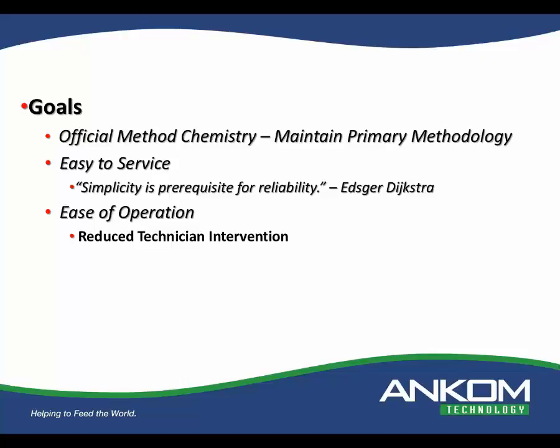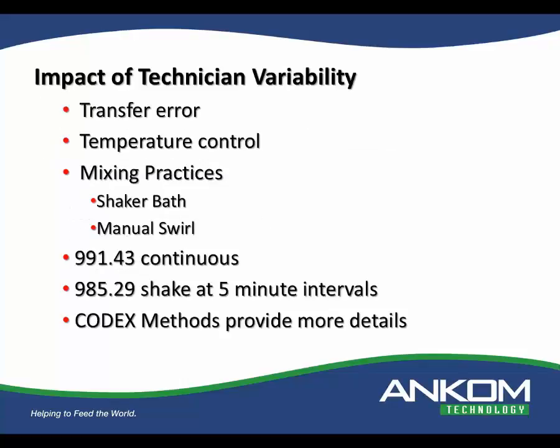Okay. Along with any automated system, the goal here is to reduce your technician intervention, which again we're going to talk about how that increases precision and accuracy. But another aspect is that it lowers per assay cost, and I believe this is your part, Chris.